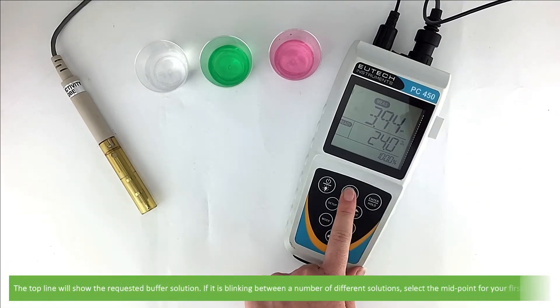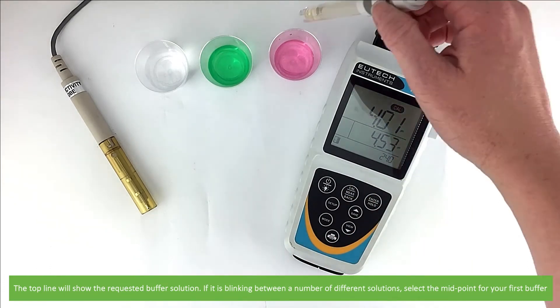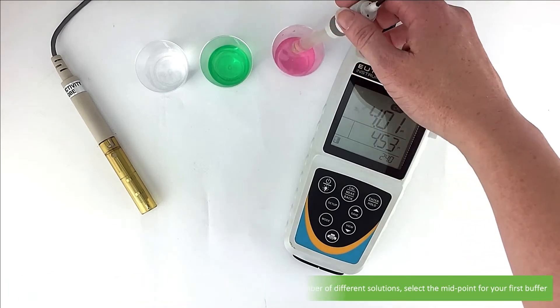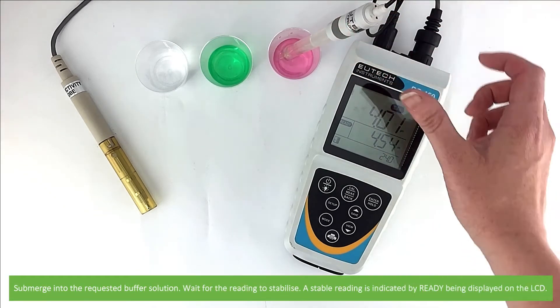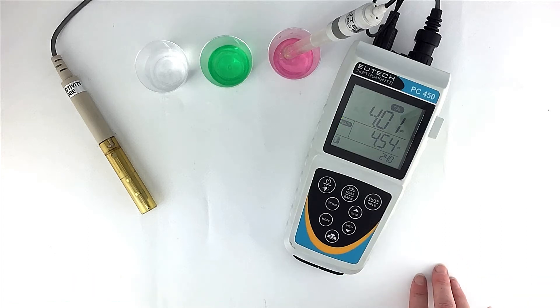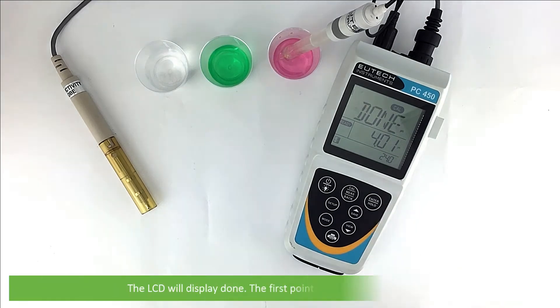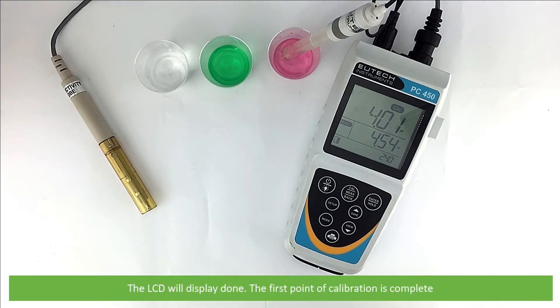The top line will show the requested buffer solution. If it is blinking between a number of different solutions, select the midpoint for your first buffer. Submerge into the requested buffer solution and wait for the reading to stabilise. A stable reading is indicated when Ready is displayed on the LCD. When Ready is displayed, press Enter. The LCD will display Done. The first point of calibration is complete.